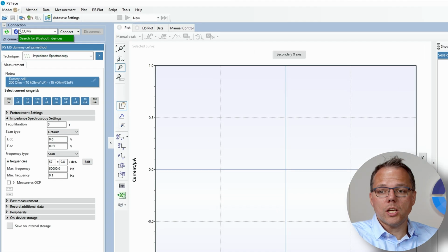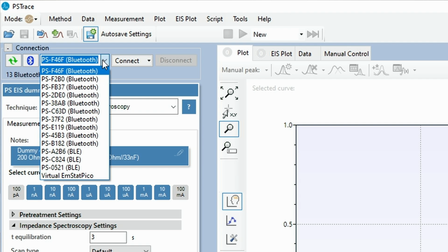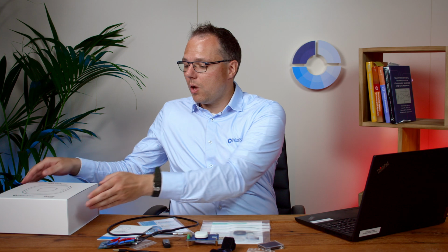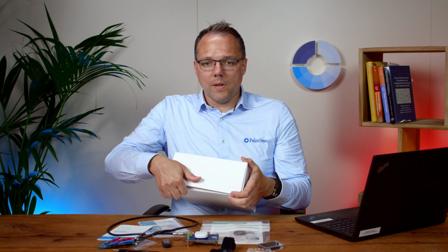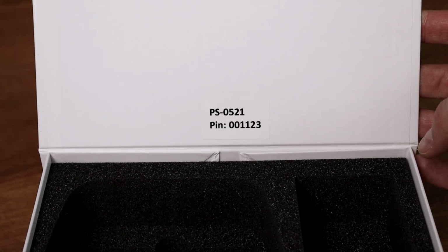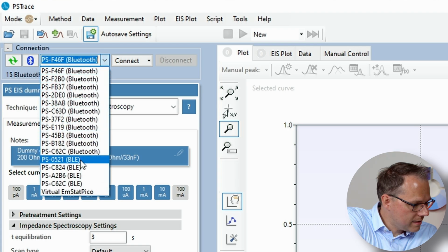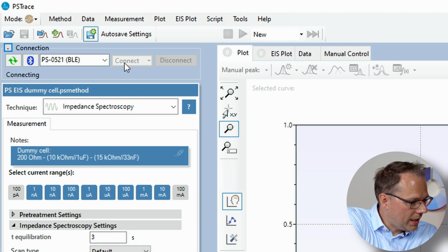So first, let's get connected to our Sensit Wearable. For that, you first press the Bluetooth button, and once it has looked for Bluetooth devices, you will get a list with a lot of letters and numbers. Which one is now your Sensit Wearable? Well, if you take the box and look inside the lid, you will find the name and a PIN code to connect the first time to this Sensit Wearable. So I'm looking for PS0521. And now I'm connecting to it.